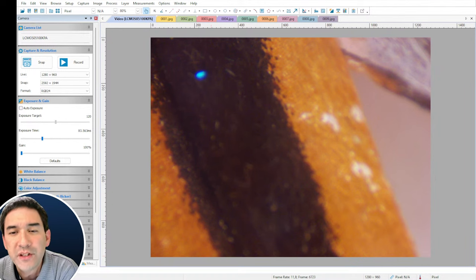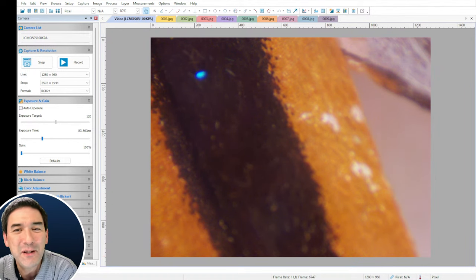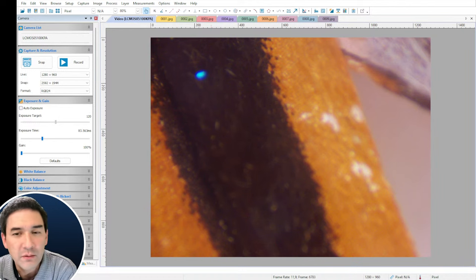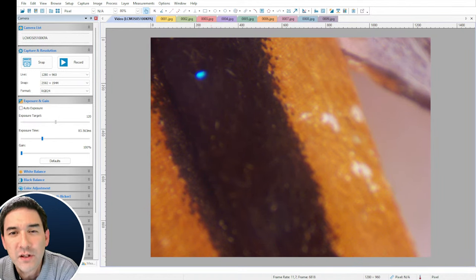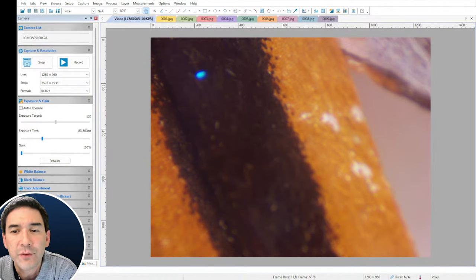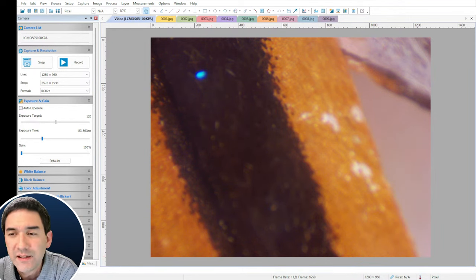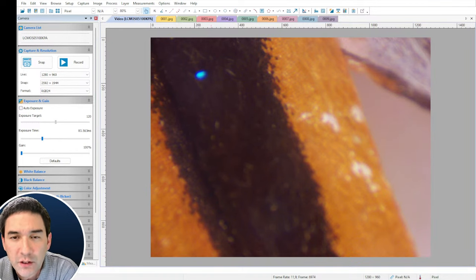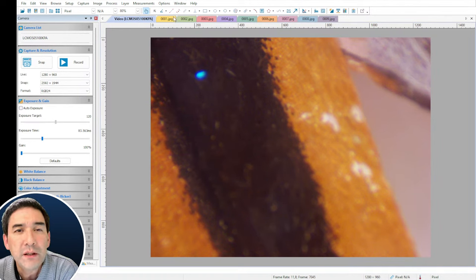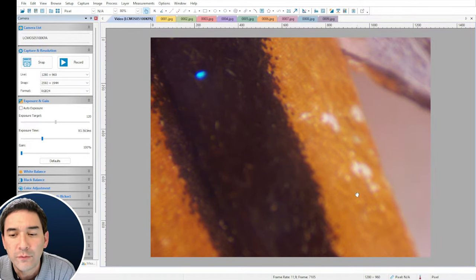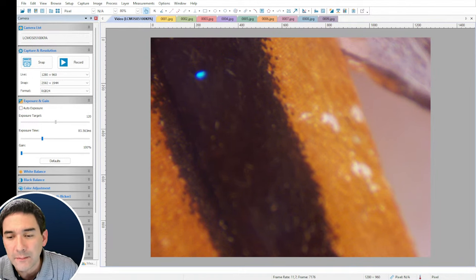I know this isn't the most interesting specimen, but I just wanted to show it to you. The image quality is poor because of the glass over the butterfly and the ring lamp reflections. But I just wanted to give a demonstration of how you can use these programs. For those who just joined: you take the pictures, save them, then import them into Helicon Focus for focus stacking.